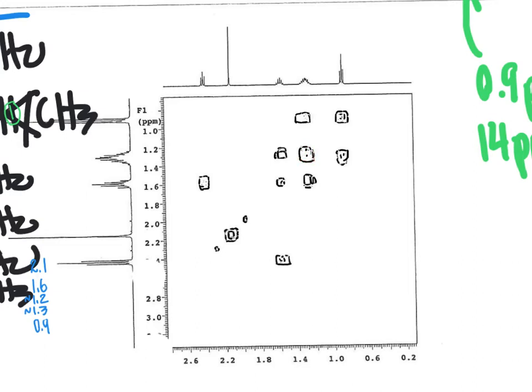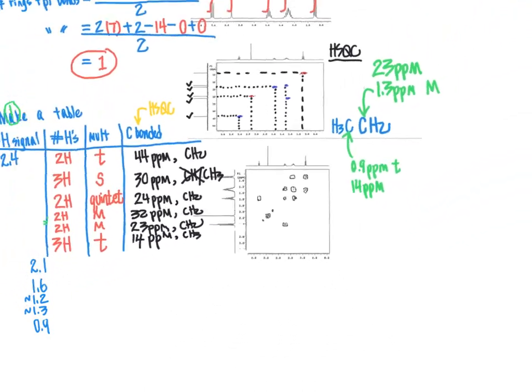So for example, if the 1.2 ppm signal and the 1.3 is correlated, it would show up right there very much in the middle. So what I'm thinking here is that since the signal that we are seeing does show up as a multiplet, and it's very close in chemical shift to that signal at 1.3 versus 1.2.